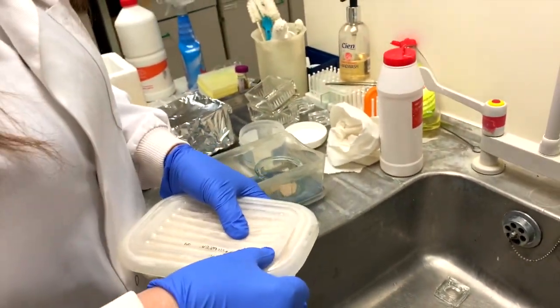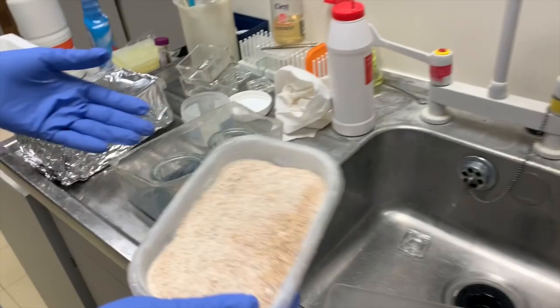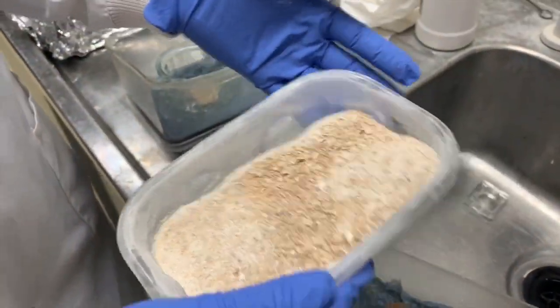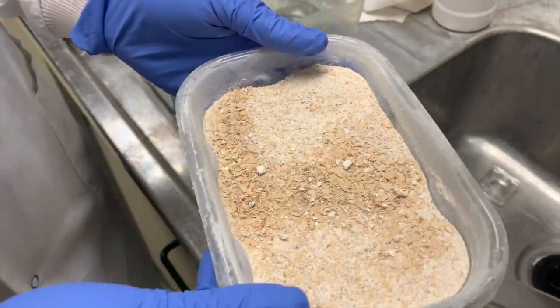So is this what they would eat if they were out in the wild? Yes. As you can see, it's just a mix of yeast and flour. These flakes are yeast flakes and they love that.